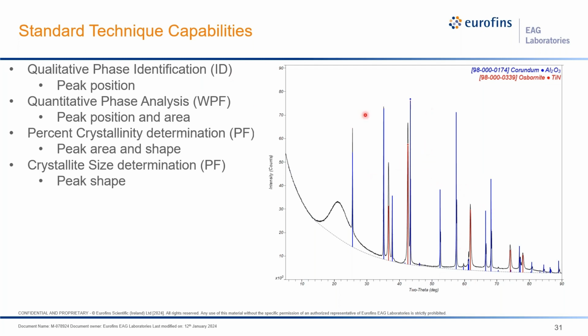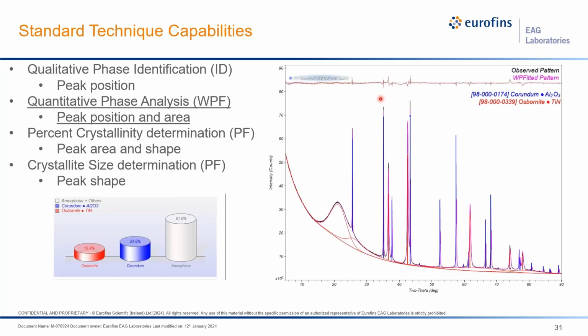It's incredibly structurally sensitive. So here we can see a spectrum with a mixture of phases, and we can clearly see that there are 2 distinct crystalline phases. There's an aluminum oxide and a titanium nitride in the blue and red lines. Now we can do a little bit more than just identify phases. We can do a semi-quantitative analysis, where essentially you're analyzing the area under the peaks, and then representing that in weight percent. You'll notice here that there's this very broad hump at a low 2 theta range, which is an amorphous material.